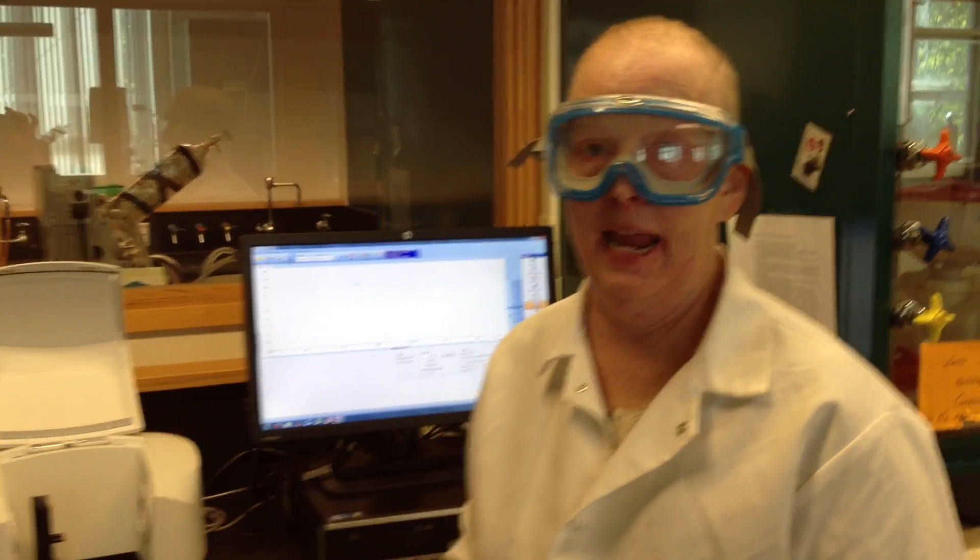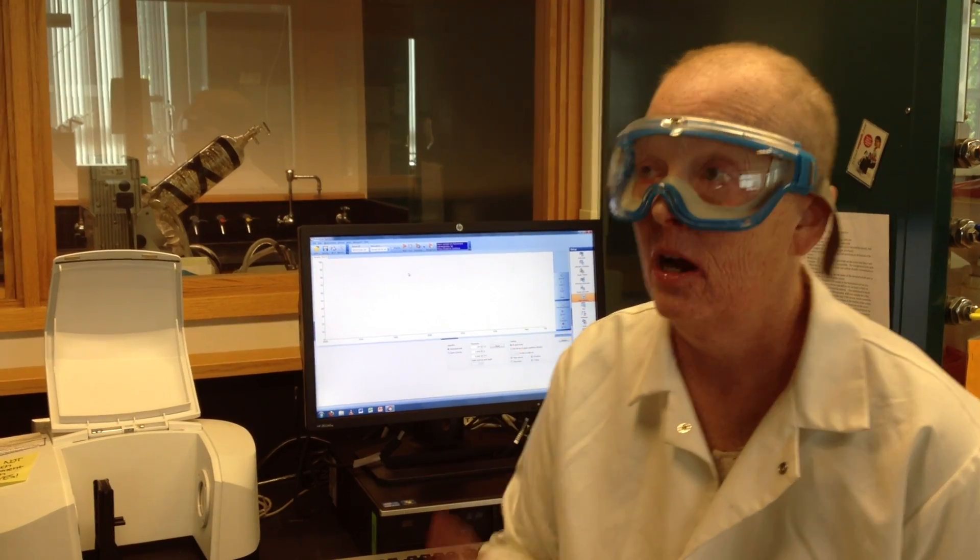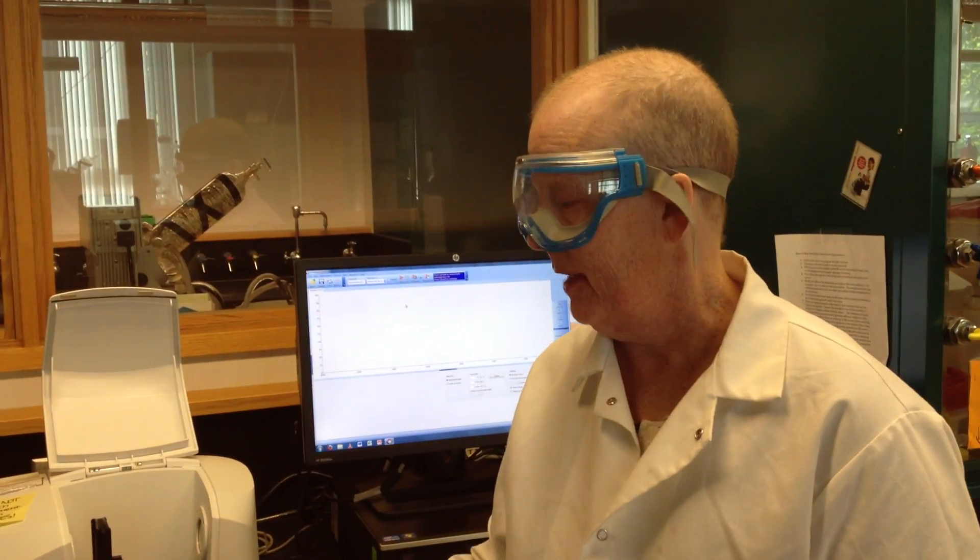The first thing I have to do is run a background. A background is a spectrum of the air. I'm going to put nothing in there. I always run my backgrounds of just nothing. You can also run a background of just a very clean cell. The problem is, sometimes when lots of students are running, the cells aren't meticulous. And because of that, the background is not always perfect. All we want to do is see air. What's in air? There's lots of stuff in air. However, it's mostly carbon dioxide and water. We're essentially running a spectrum of carbon dioxide and water that will be subtracted from the spectrum of your sample, which will also have carbon dioxide and water. By subtracting the two, what you'll have left is your sample. You don't want the air peaks to obliterate your spectrum. That's how sensitive this thing is.